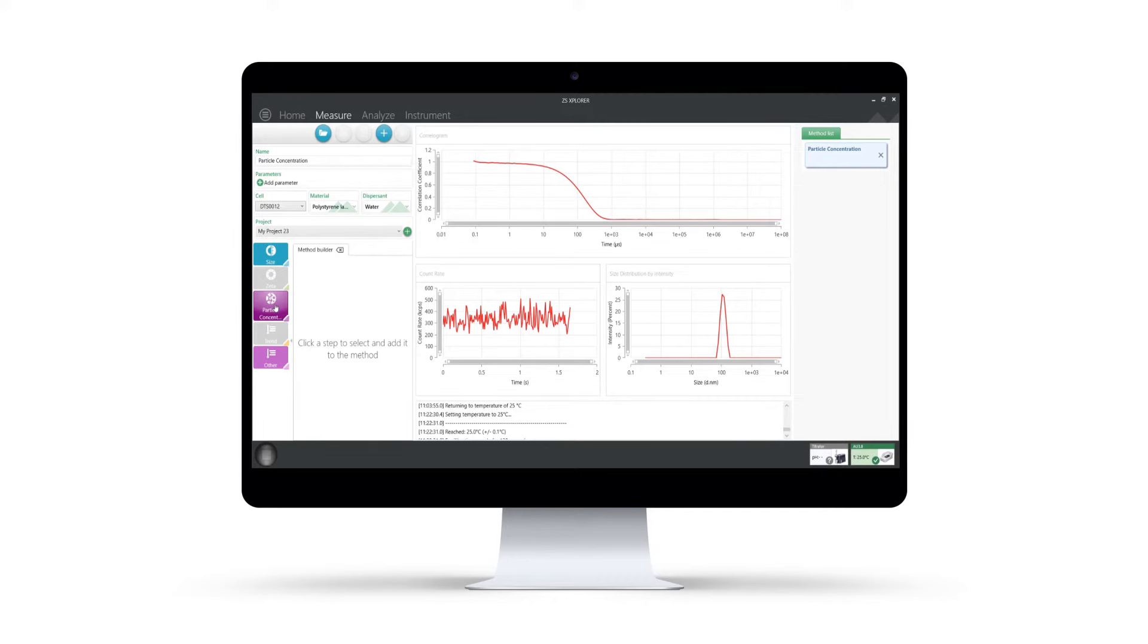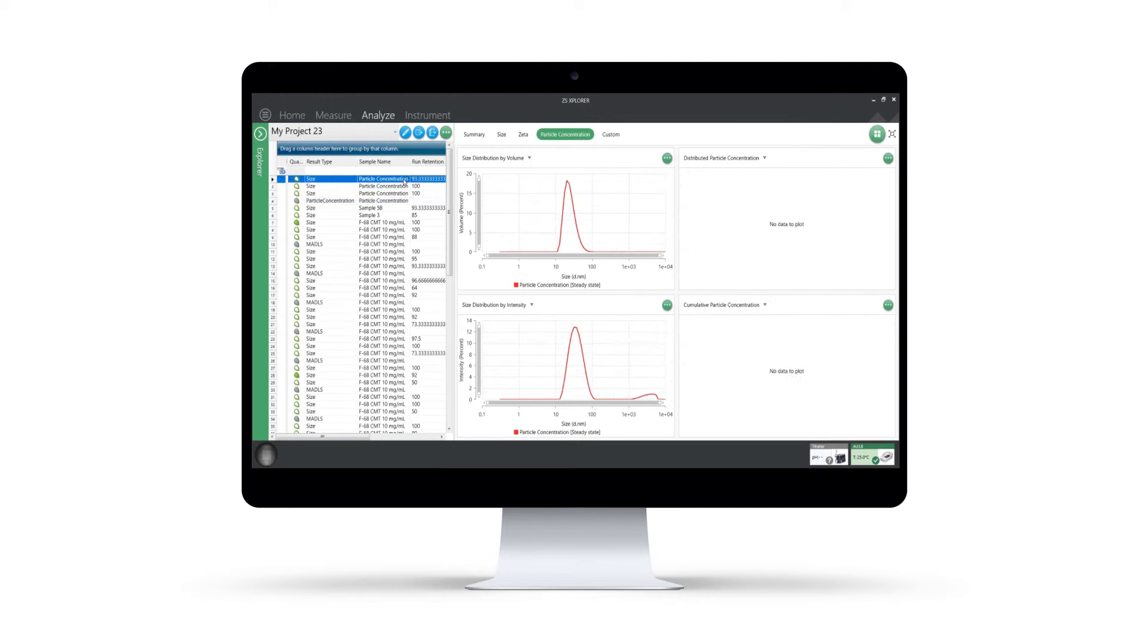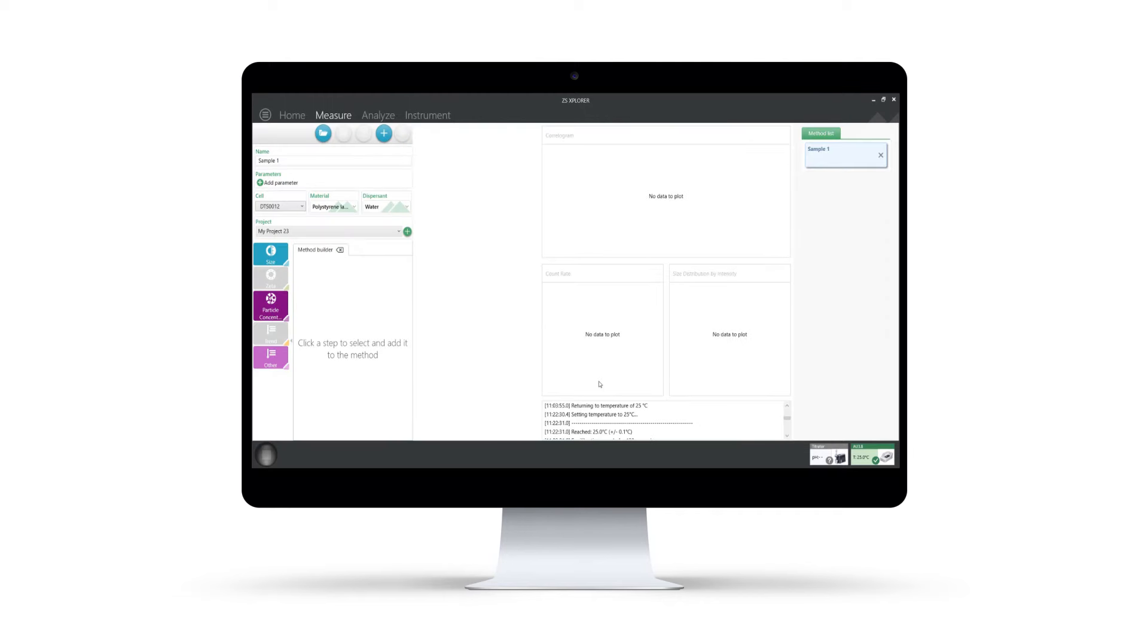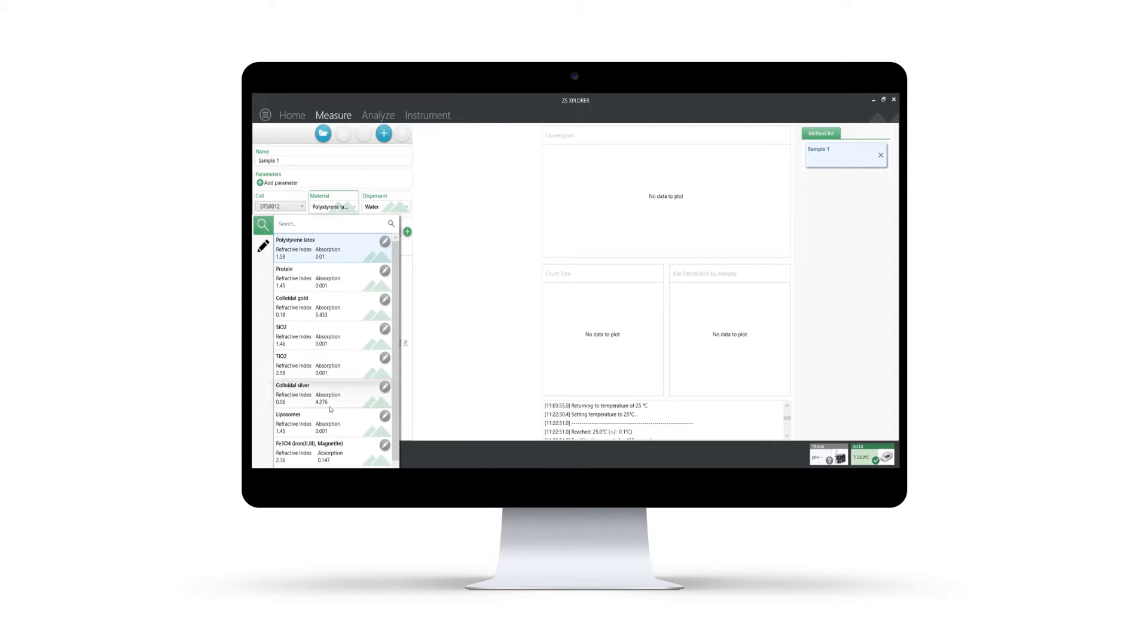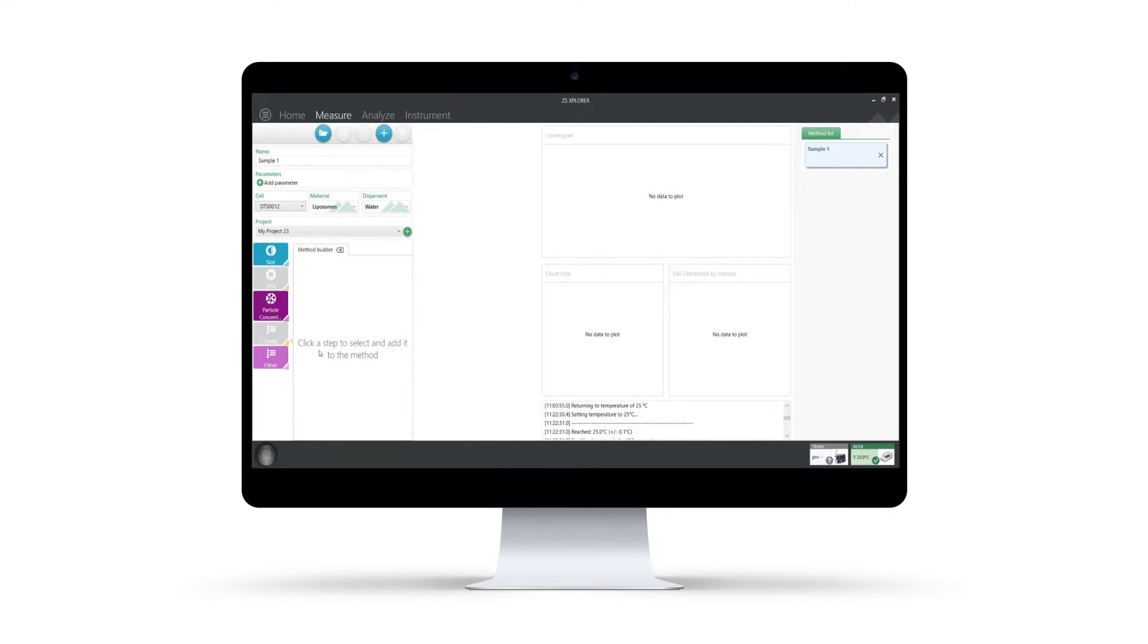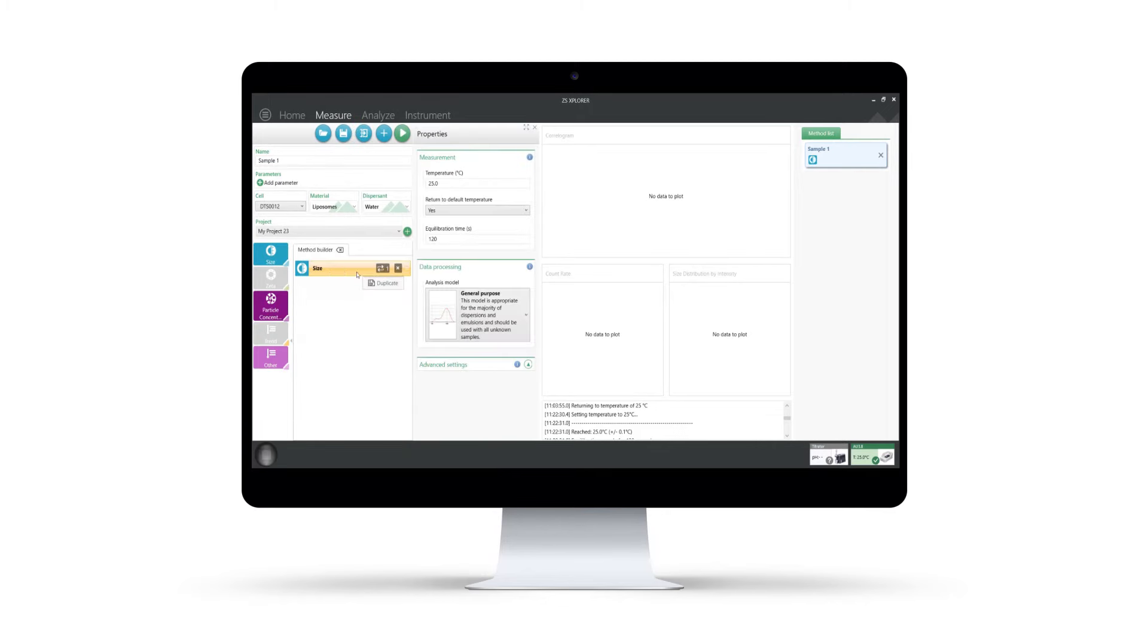This novel approach can also be used to determine particle concentration without the need for calibration or specific sample information. This new functionality is supported by a revolutionary new software platform, ZS Explorer, which puts the sample and the user at the heart of the measurement. It features intuitive guided workflows that make setting up a method and performing a measurement easy and straightforward.